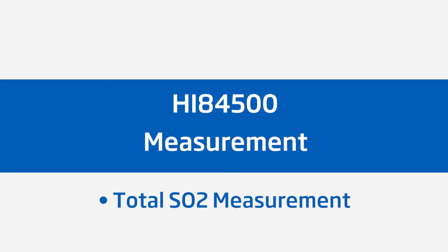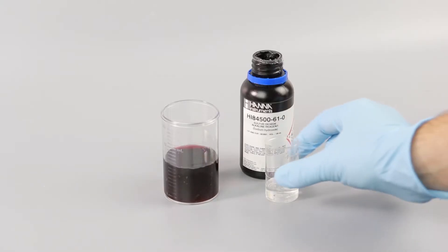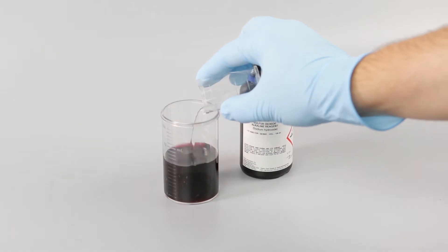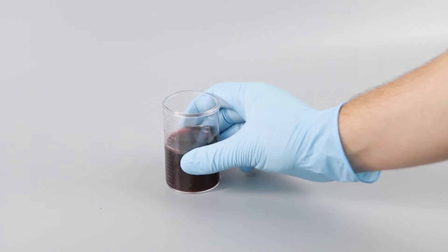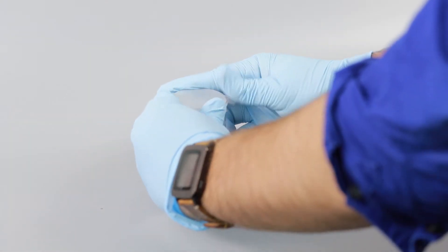You can also measure total SO2 by taking a couple of extra steps. Take your 50 ml sample of wine and add 5 ml of the supplied HI84500-61 alkaline reagent. The alkaline reagent frees any bound SO2 so that it can react with the test. Stir the beaker, then cover and let it sit for 10 minutes.